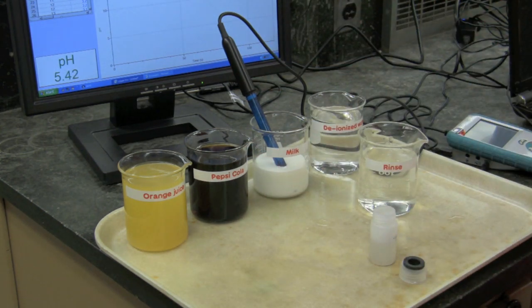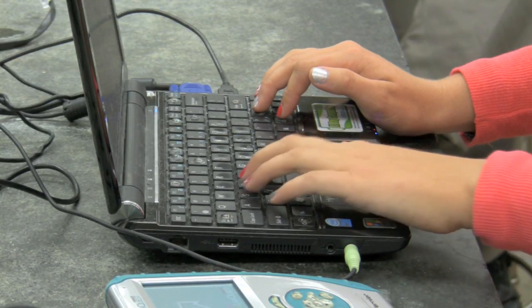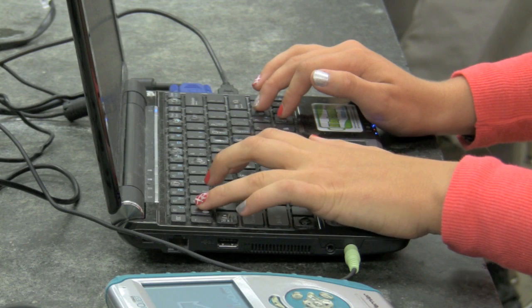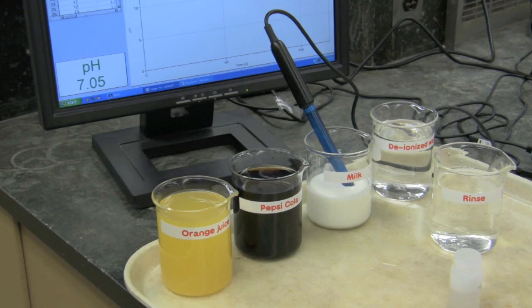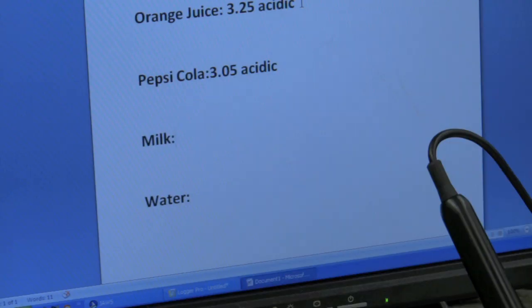She will record the data given by Logger Pro again in the Word document. pH equals 6.98, pH equals 7.05. 7, period, 0, 5, space, B, A, S, I, C.